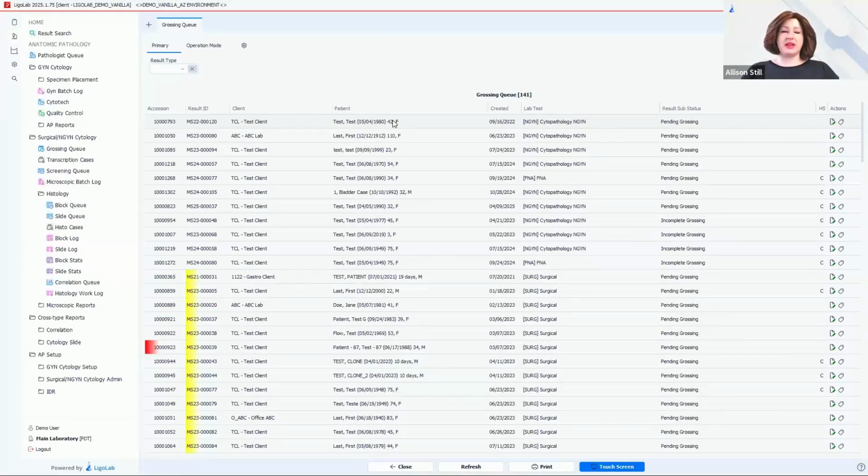So depending, if that is a significant issue that has been designated with that tag or workflow action, then yeah, you can have it hold the report until the issue is resolved.